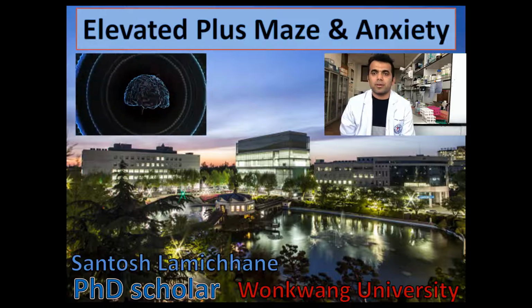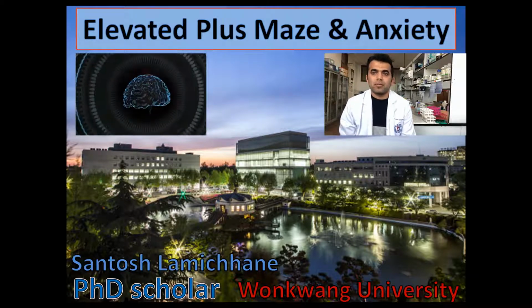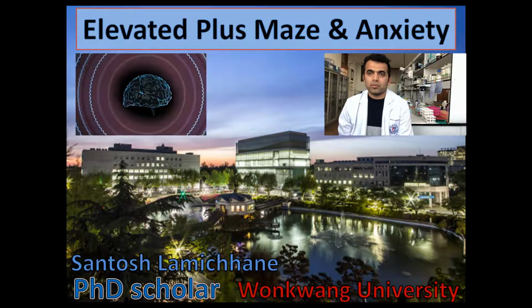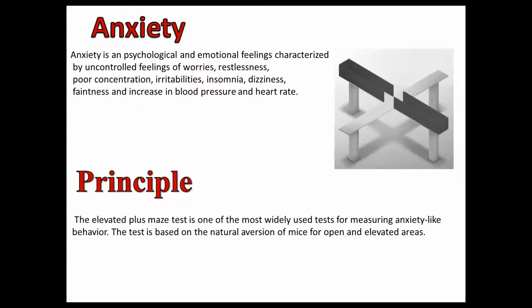Today I'm going to explain about the elevated plus maze, which is used to measure the level of anxiety in the rodents. Today I will explain about the detailed procedure of the elevated plus maze in this video.